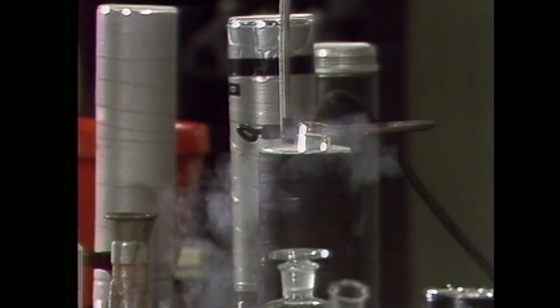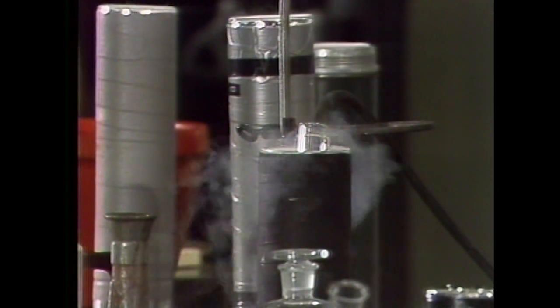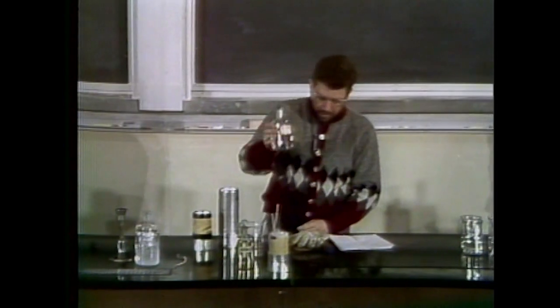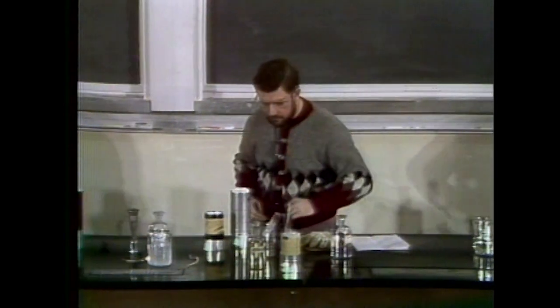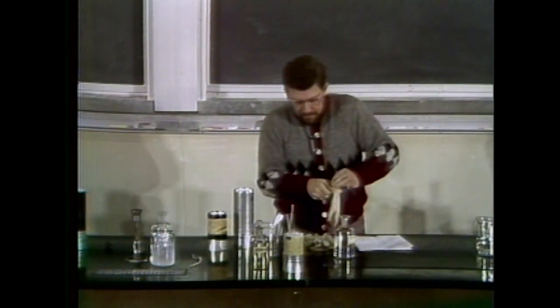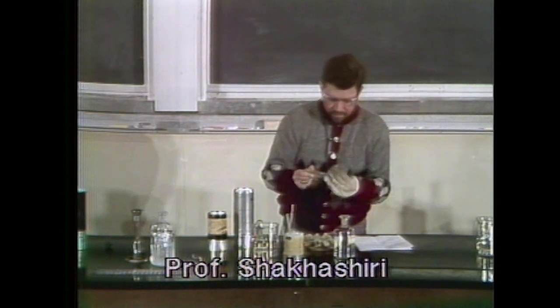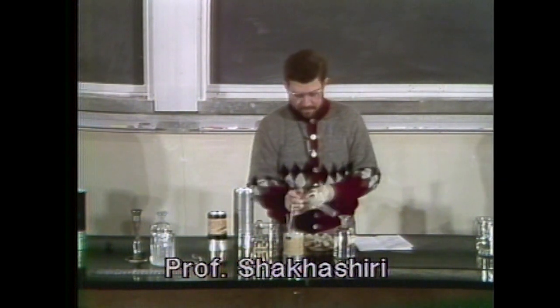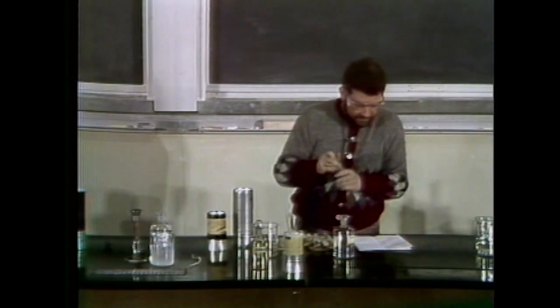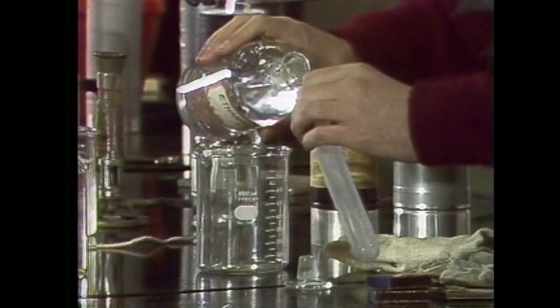I'm also going to look at another compound, actually everyone's favorite compound. That's ethyl alcohol. And to do that, I need to use this test tube that I was using before. Just warm it up a little bit here. It's pretty cold. And I'll take the alcohol.